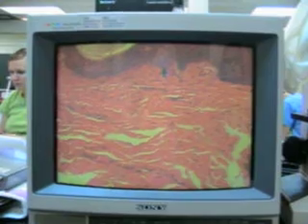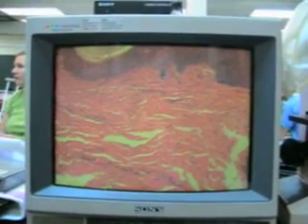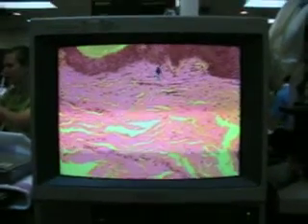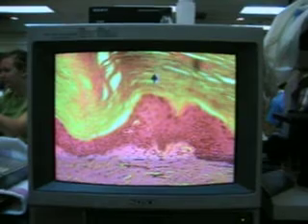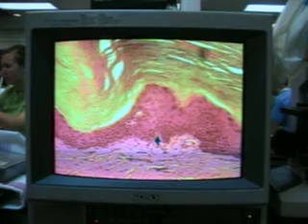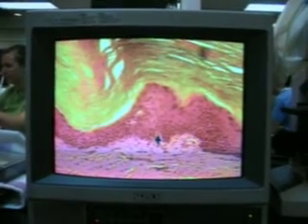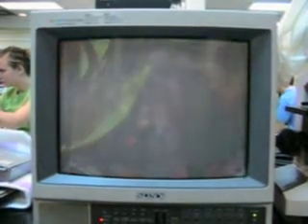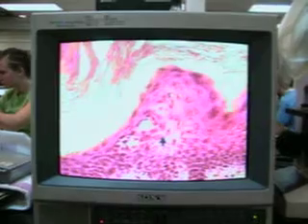Okay, so we're going to go to higher power here. Increase the light. Oops. Okay, so we can bring this down. All right, you should go higher. Pause. Good. Oh. Here we go. That was great.